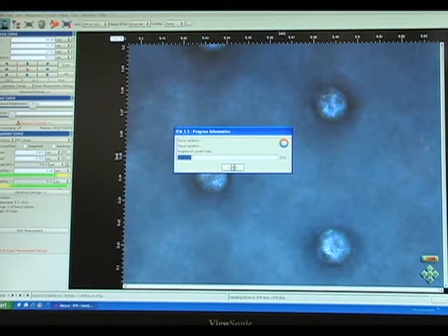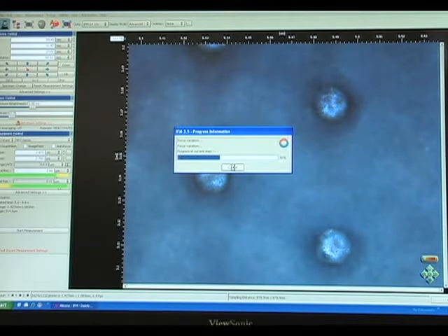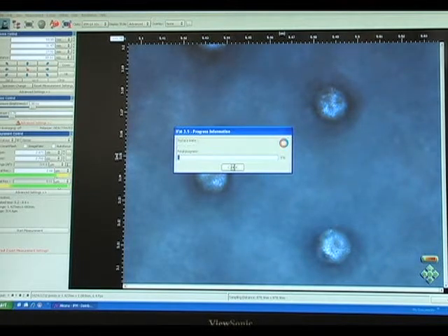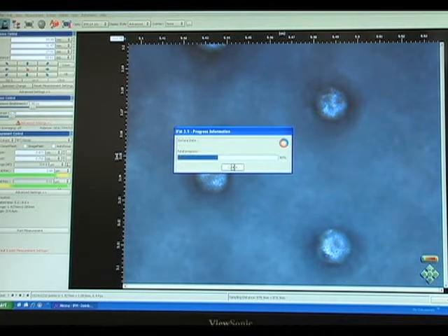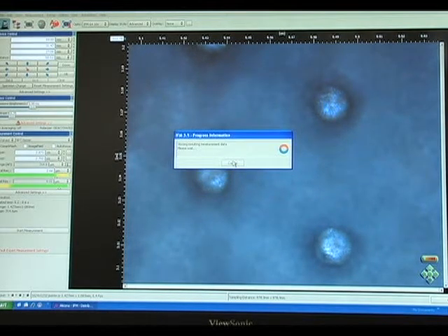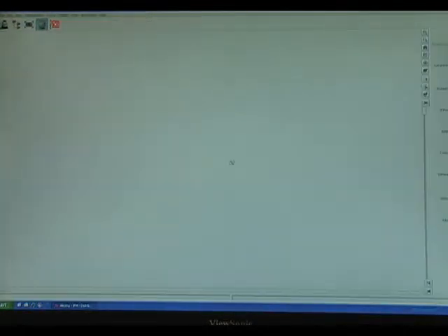What is now happening is the head is moving, and as the head moves it is collecting data. It is now finished collecting that data, and we now go in and produce a 3D model of the surface, which can be seen here.